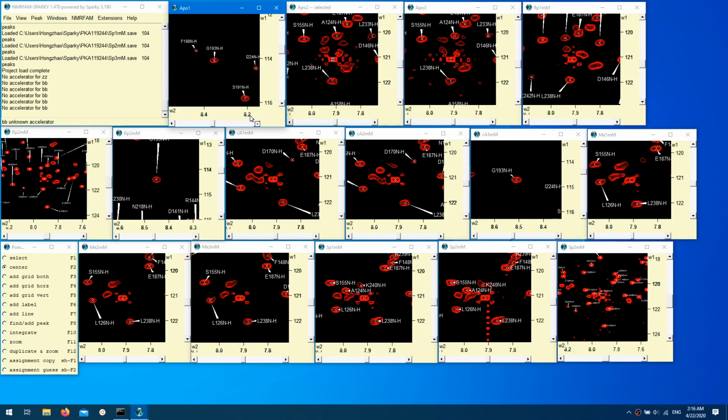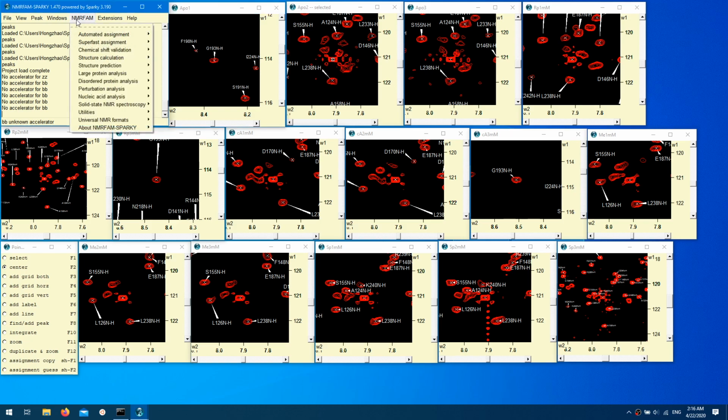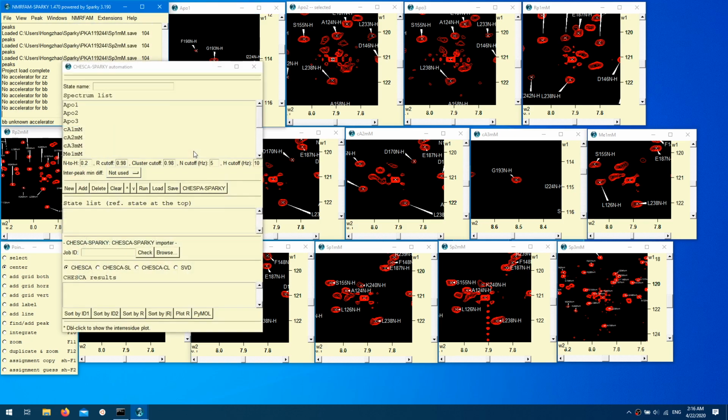In this video, we are going to talk about how to set up the chemical shift covariance analysis, or CHESCA. You can start CHESCA here in NMRFAM, then perturbation analysis, CHESCA-SPARKY.